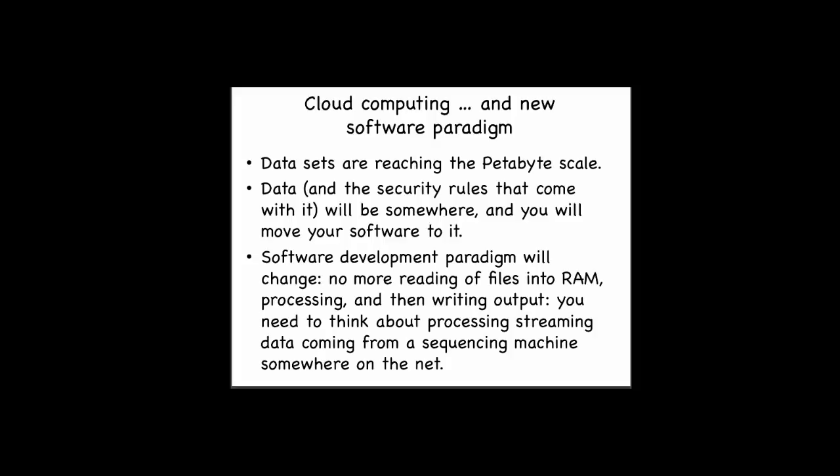Another thing that is changing in the software development world is that, although most of what we're going to be doing this week is still in that space, it's becoming less about reading a file into memory, doing some computes, and writing the output file, and more about working on streaming data. Oxford Nanopore, for example, thinks about the data streaming through the machine: as it comes through, some analysis is done on it, some files are made, and at the end, when it's finished streaming, you write a file output. All of these things are changing the paradigms in which we're thinking.